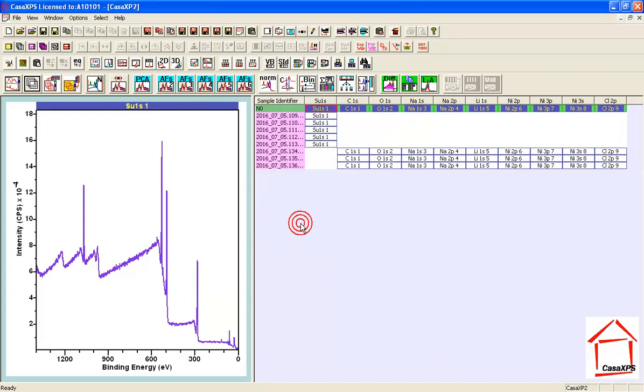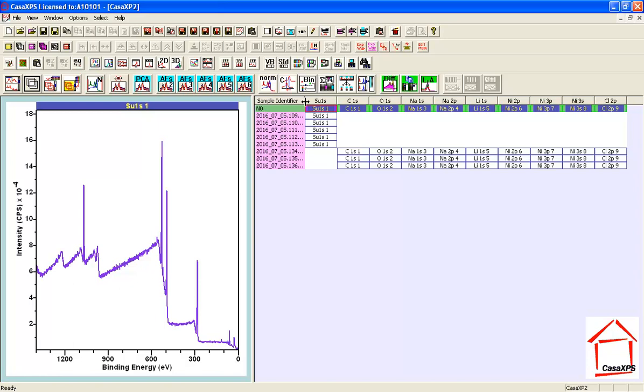And then accept the adjustment to the label in each row. So now I have my VAMAS blocks that were all measured from the same sample that is labeled N0 in the same row.